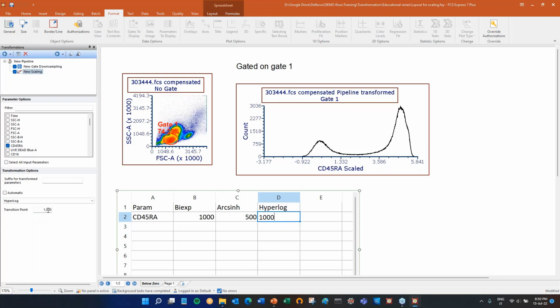Okay, then of course, if you set 1000 or 900, it will probably make a small difference. So you can also write 900 here, that's fine. We just want to avoid very bad stuff. And then live and dead.